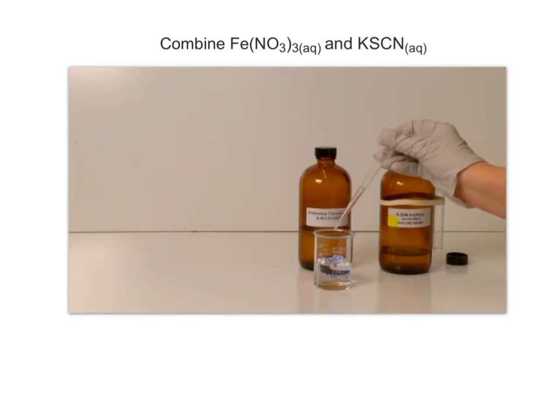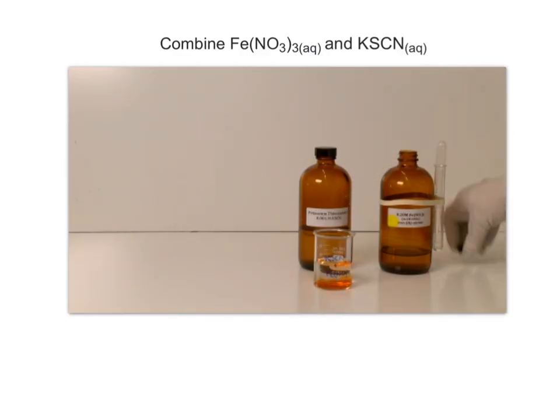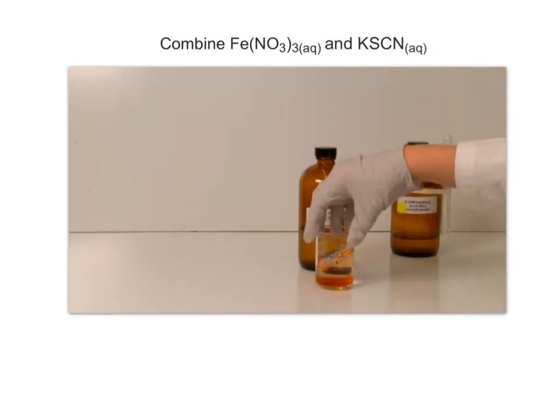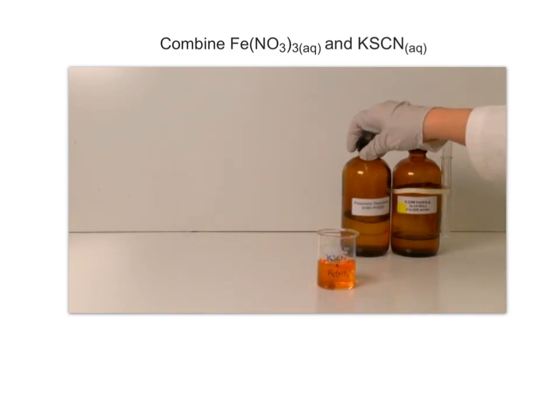Upon addition, the solution turns reddish-orange. Note that no precipitate is formed. Instead, the color is due to the formation of the FeSCN2+ complex ion.